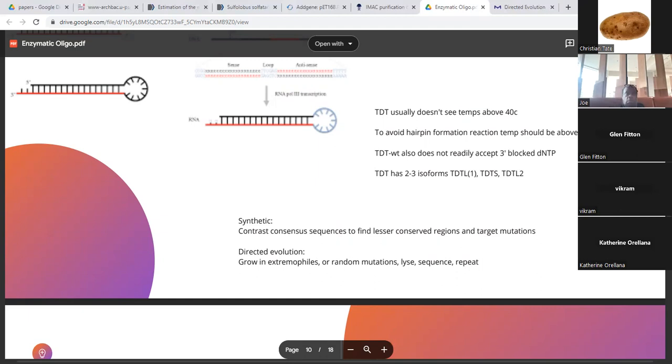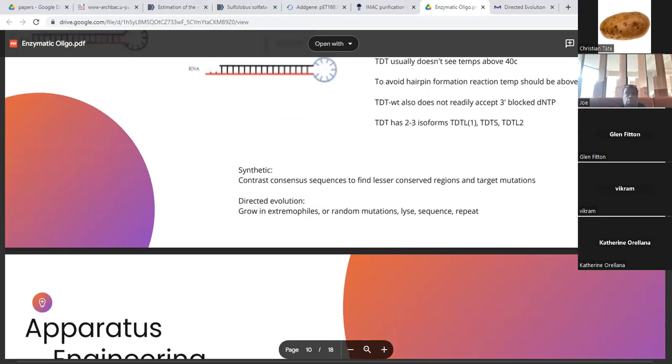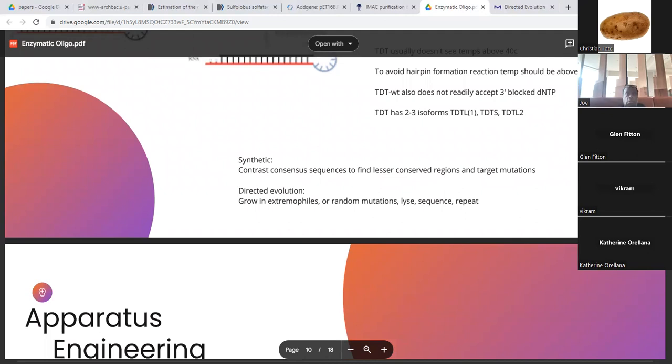And then you incur random mutations. You could either use a site-directed approach using primers to do that, or the paper that I was referencing, which seemed to have a pretty good amount of luck, used leaky, error-prone polymerases to do that. You lyse the cells, and then you're left with a bunch of random mutations on each copy of the plasmid, and then you inject those.